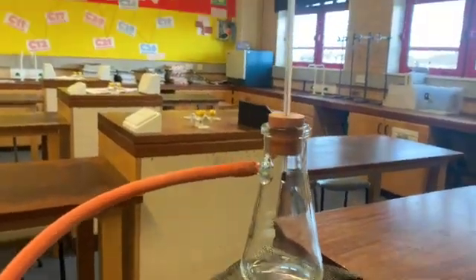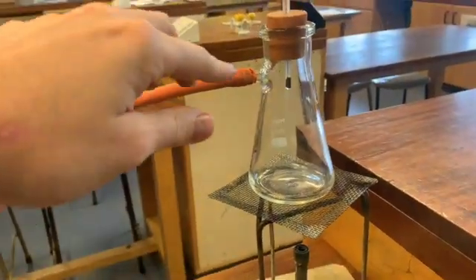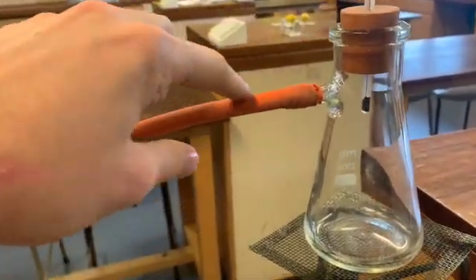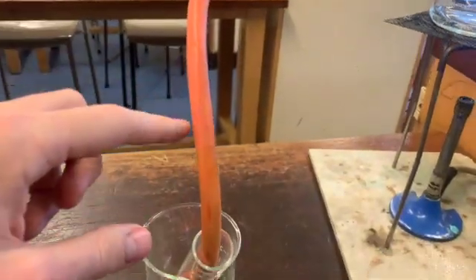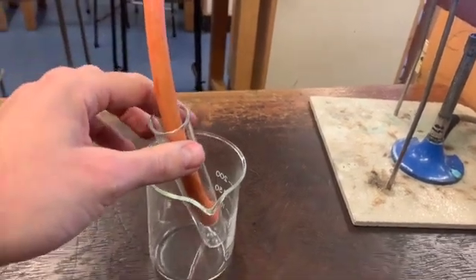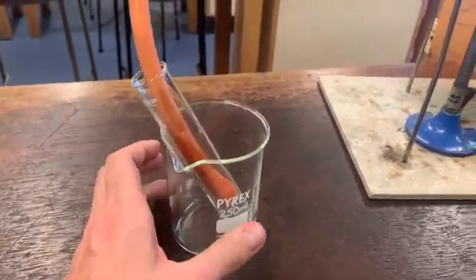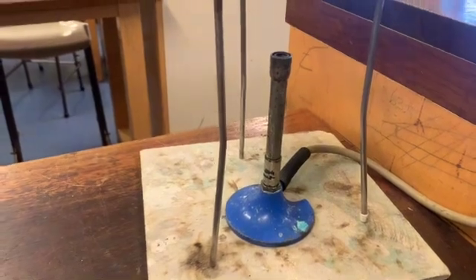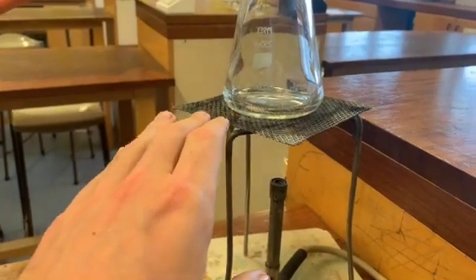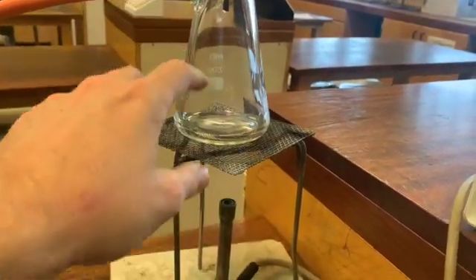The glassware for this experiment is really easy to get. Here we've got a conical flask, which has had an arm attached to it. You can see this little arm on the conical flask. Connected to that arm is a delivery tube, and this delivery tube goes into a boiling tube here. And that boiling tube is placed in a 250 milliliter beaker.